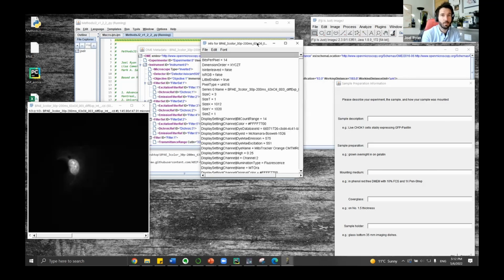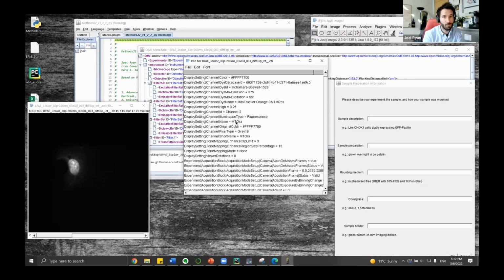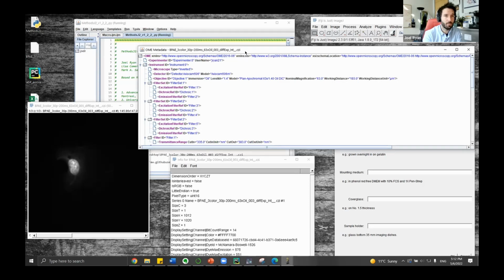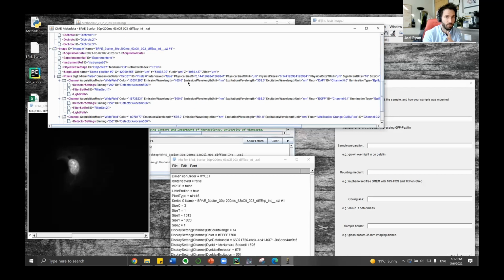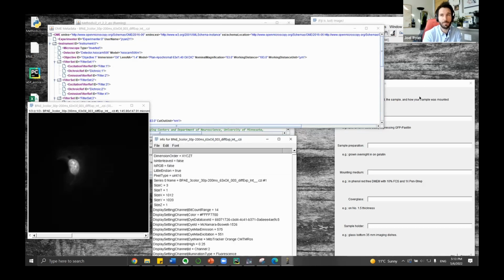And we have 2 other windows that loaded up. So one is the metadata that is directly from the file header. This is a CZI file. It's a Zeiss file. So it's in this sort of Zeiss format with those vertical slashes between all the tree settings. And we also have the OME metadata. That's been sourced by Bio-Formats, in the XML tree structure. And so these are handy just to prompt the user if anything's there. We don't access it directly, but it's always handy to see.